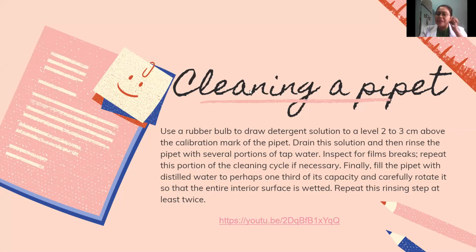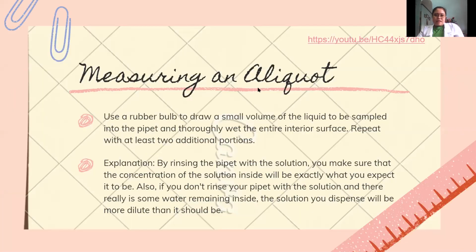So you can review anytime the procedure on how to clean our pipette. Okay? And then the measuring of the aliquot, sorry. Ang ako ang gibutang lang diri nga procedure kay katong first one kasi may question dito, you have to explain why are we doing this procedure.